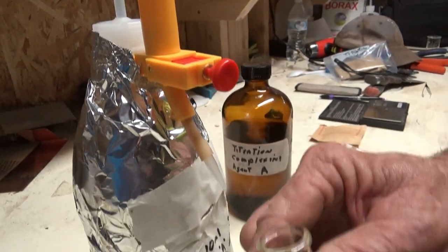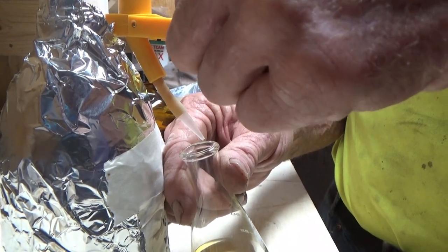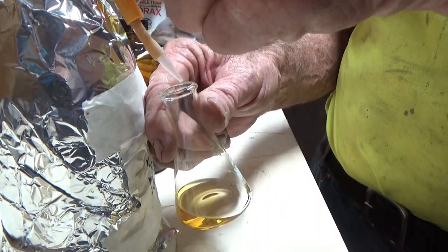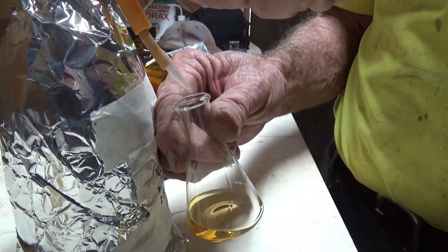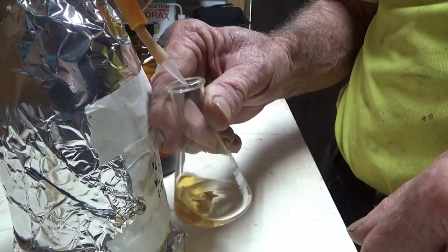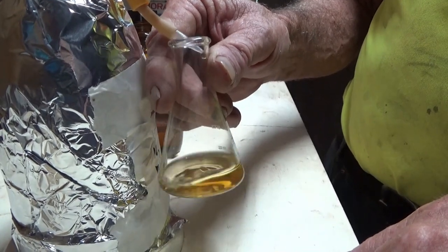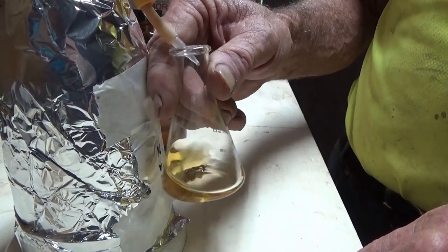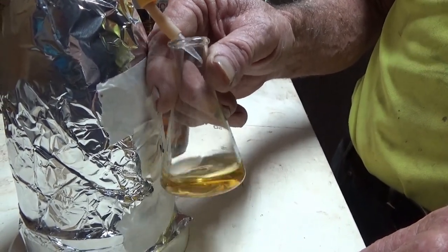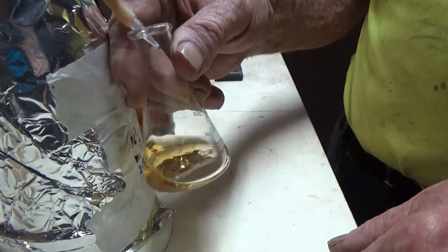Now at this point, we take the solution that we're testing and I start. Come on, slow down. You don't want it to go real fast. And I'm stirring it here by just swishing it around. You notice it's a nice kind of lemonade yellow there.